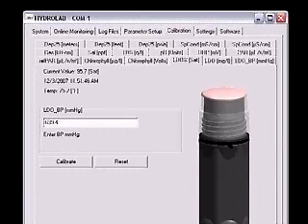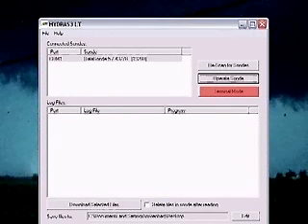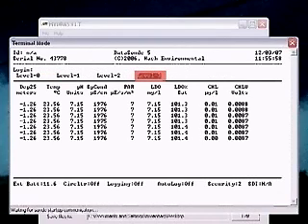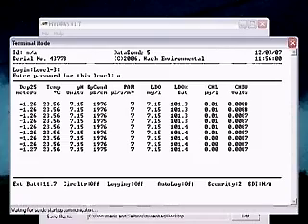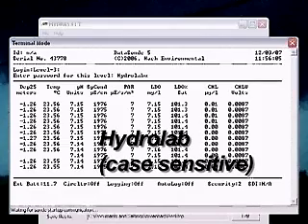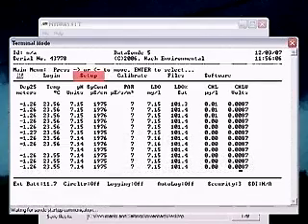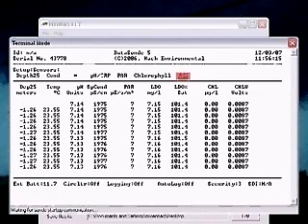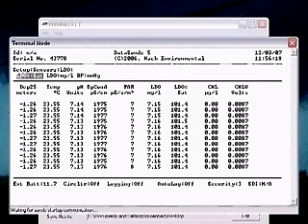Verification: Click the red X in the upper right corner and close the calibration window. In the connection window, click the button labeled Terminal Mode. Using the arrow keys, highlight Log In and press Enter. Highlight Level 3 and press Enter. Type the password and press Enter. The default is Hydrolab and is case sensitive. Use the arrow keys to highlight Setup and press Enter. Highlight Sensors and press Enter. Highlight LDO and press Enter. Highlight LDO % SAT and press Enter.